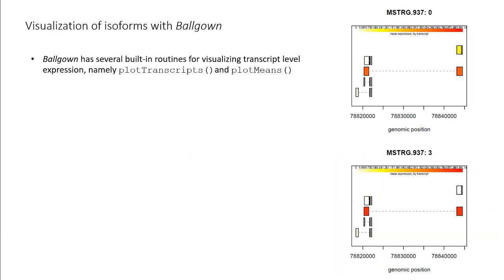At this point, we have loaded in our count data and provided our experimental metadata in the pdata table. We can now use some of the built-in Ballgown routines for visualizing our transcripts. The two main ones are plotTranscripts and plotMeans.